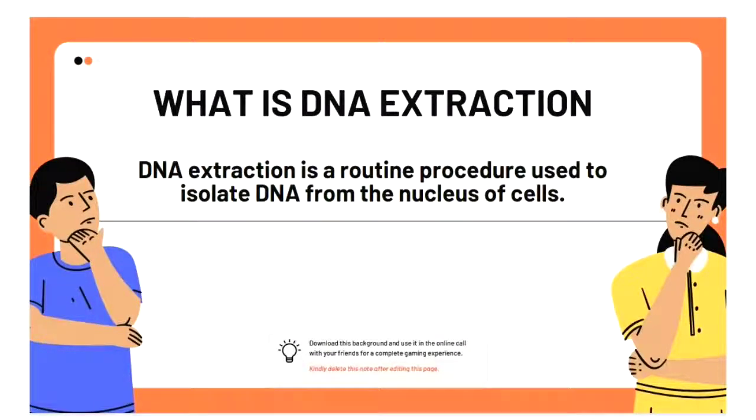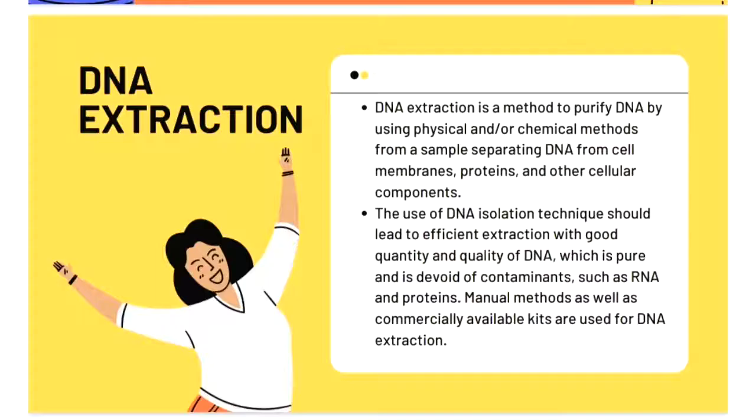Today I want to present about DNA extraction. So, what is DNA extraction? DNA extraction is a routine procedure used to isolate DNA from the nucleus of cells.